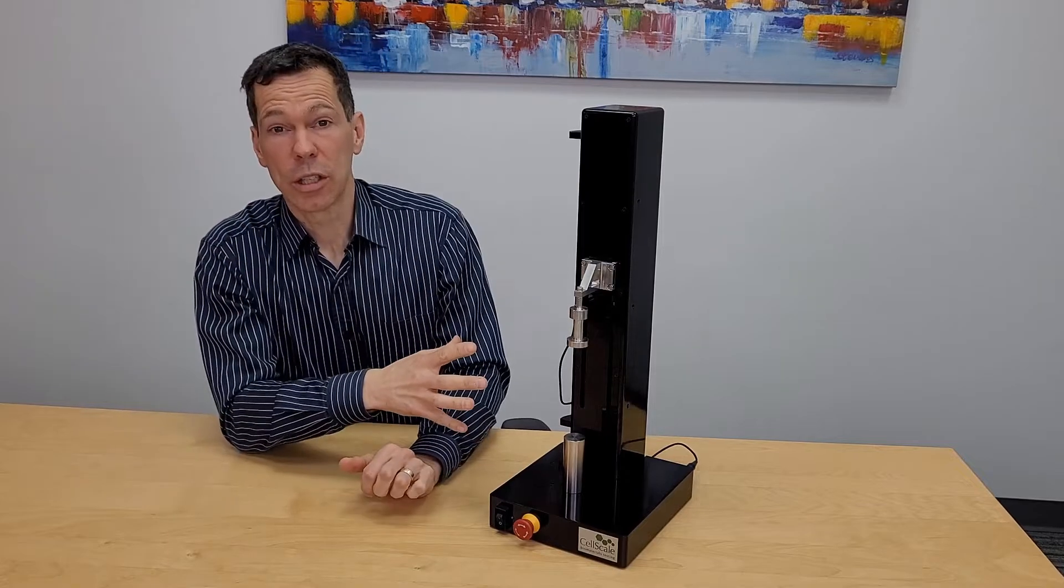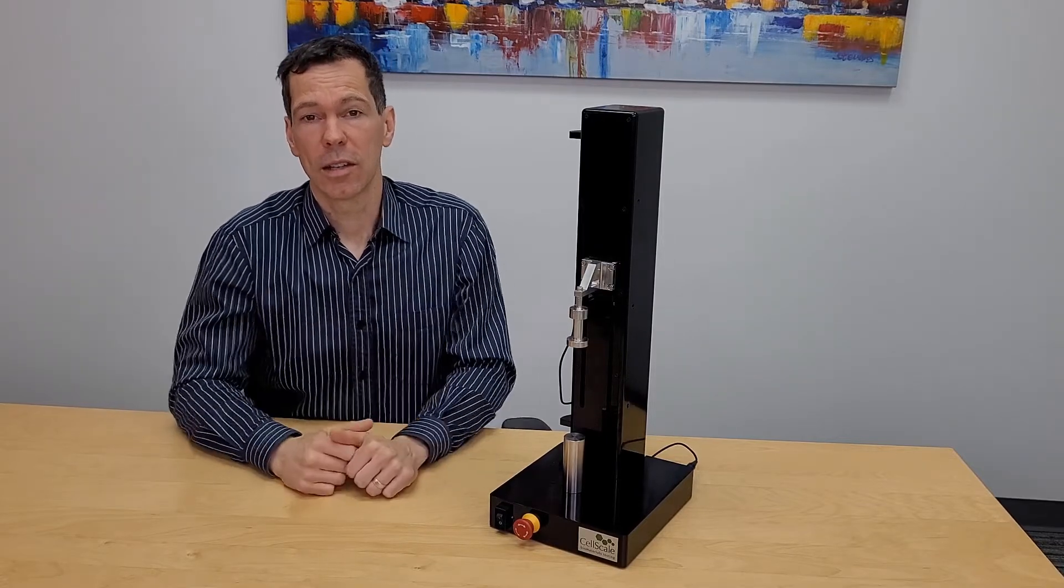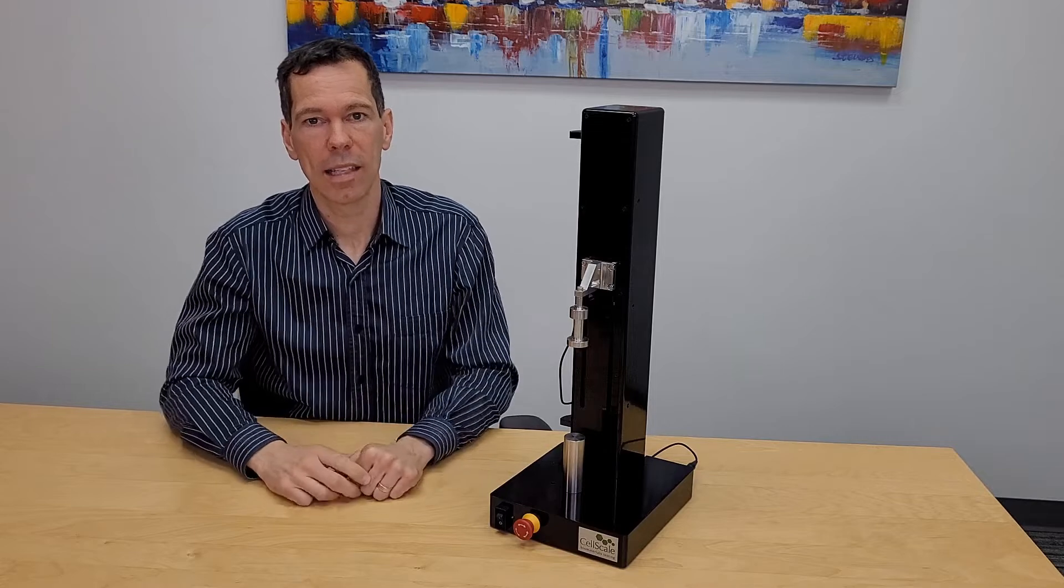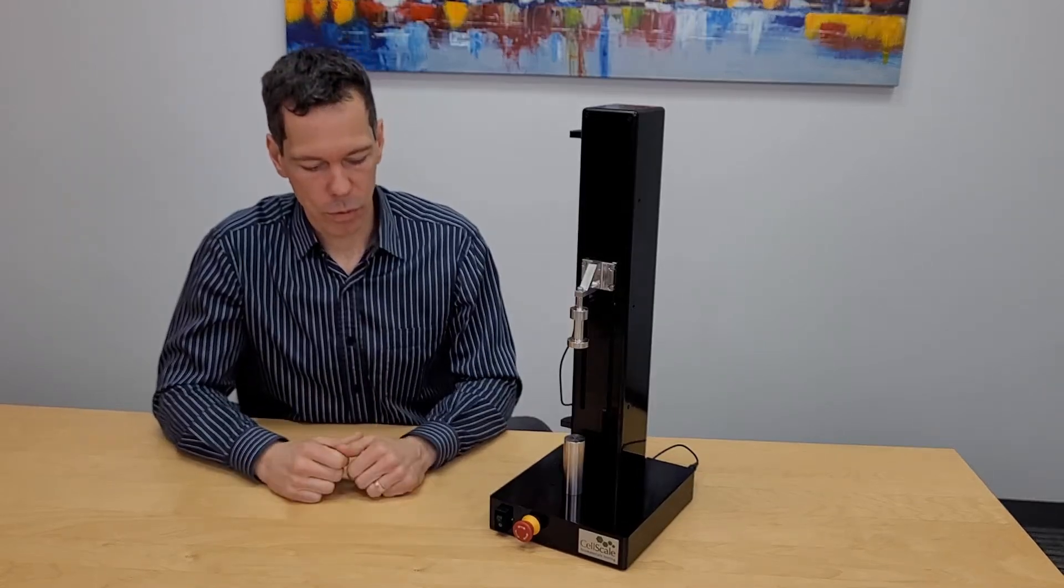This is the new generation of the system. We've been selling the UniVert for many years and our users find that once they have that test capability at hand, they really find a lot of uses for it.